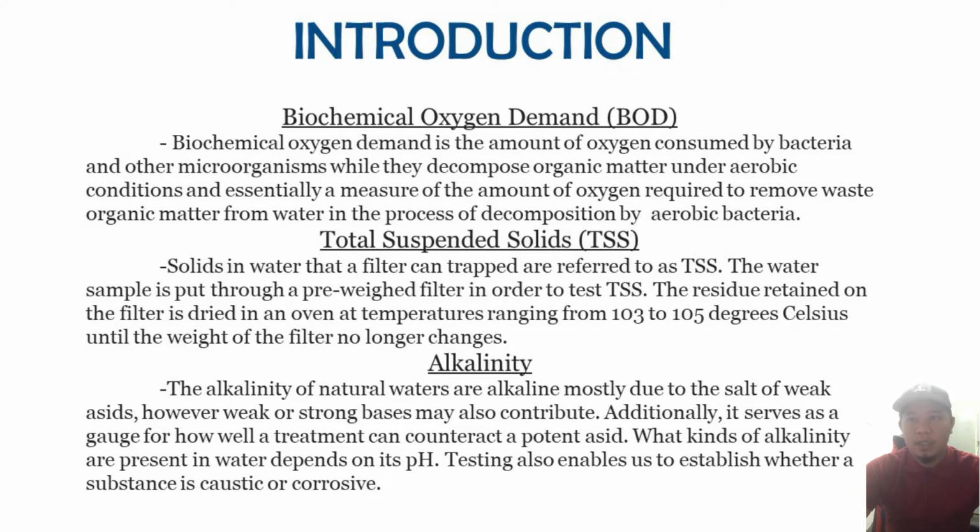So, for BOD, biochemical oxygen demand is the amount of oxygen consumed by bacteria and other microorganisms while they decompose organic matter under aerobic conditions, and a measure of the amount of oxygen required to remove waste organic matter from water in the process of decomposition by aerobic bacteria.